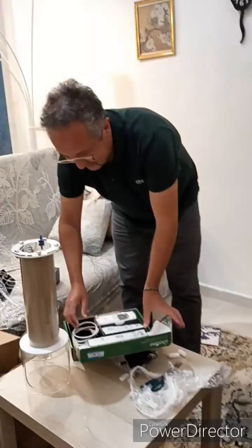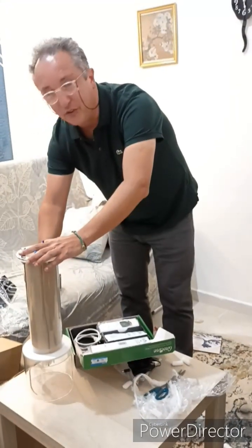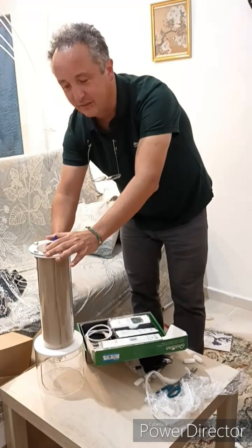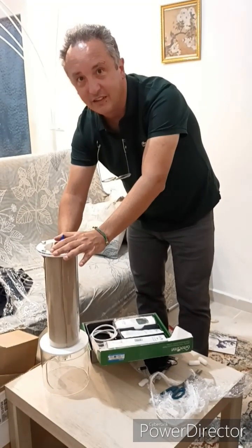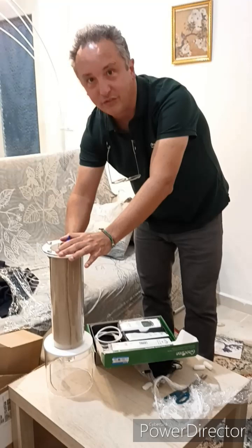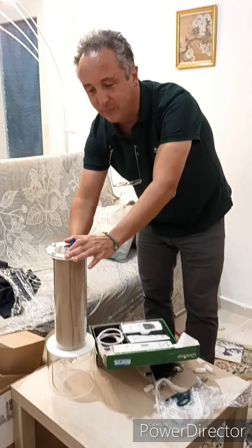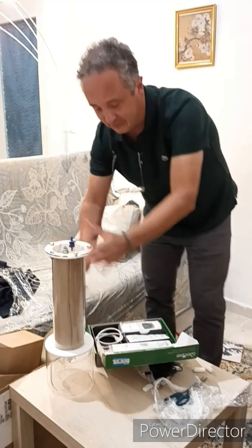We will put a nutrient solution inside this bioreactor, because these microorganisms need nutrients — so nitrogen, phosphorus, and a wide range of micronutrients.